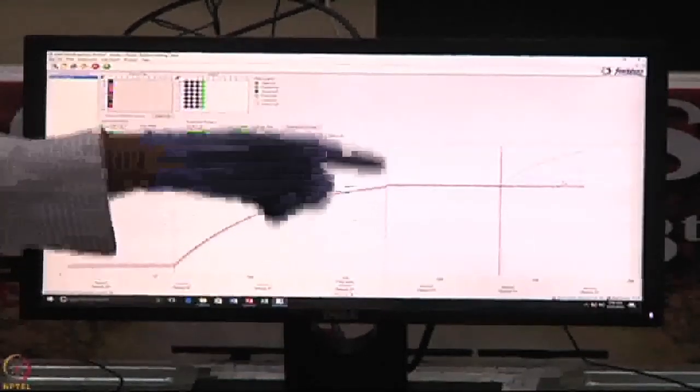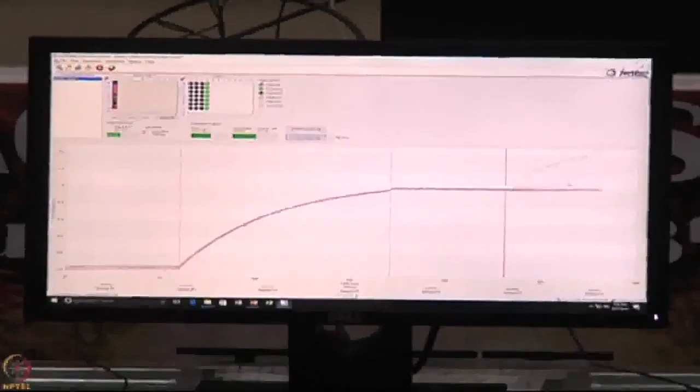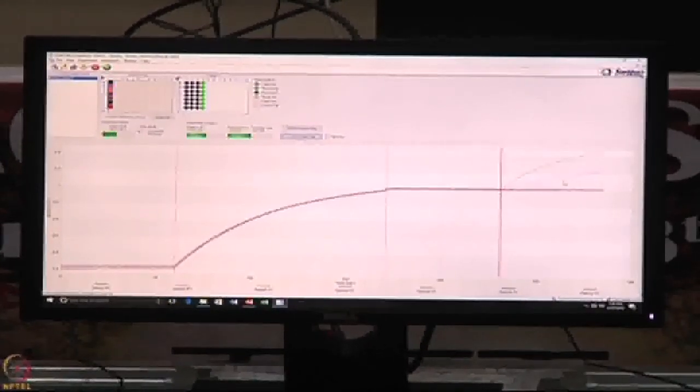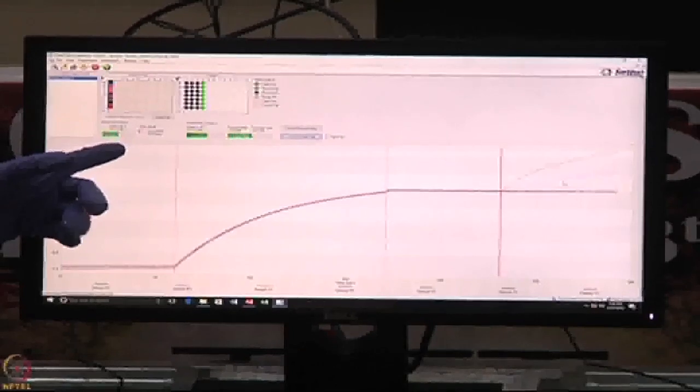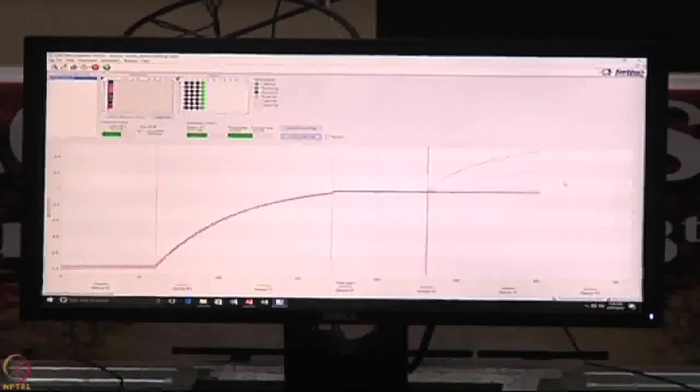So nice dose distribution. I think the lower ones are not picking up, in the sense that the samples are too diluted, or otherwise we have to extend the time. It has to come very nicely, the dose distribution, because we had just put around 120 seconds. Probably we have to extend by another 60 or 120 seconds, so the lower ones also will come very nicely. So let's acquire for 120 seconds.